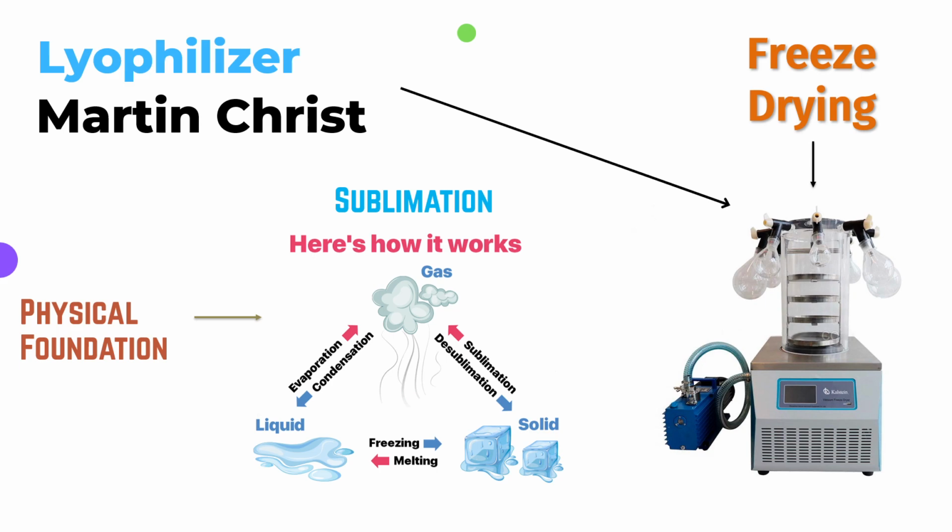So lyophilization is the process in which ice directly gets converted into gaseous form without being converted into liquid form or state. What it actually means is it omits the conversion of solid into liquid and then gas. It directly converts the solid into gas, and this process of lyophilization is based on the physical foundation of a sublimation process. So the conversion of solid directly into gas is known as sublimation.